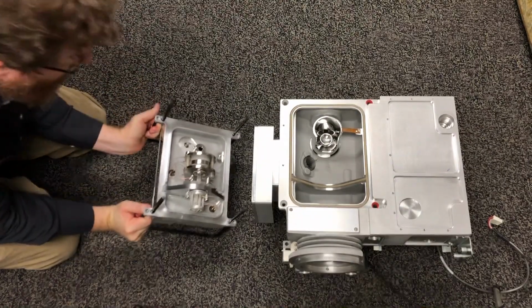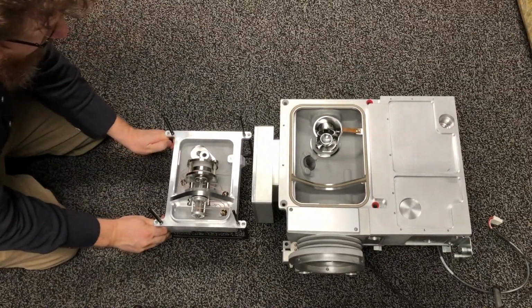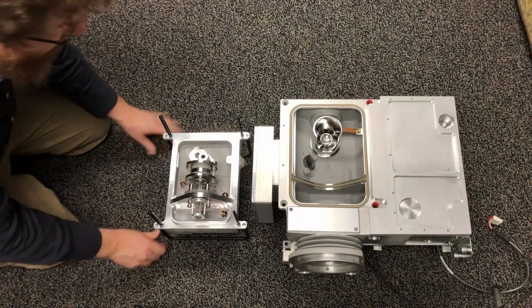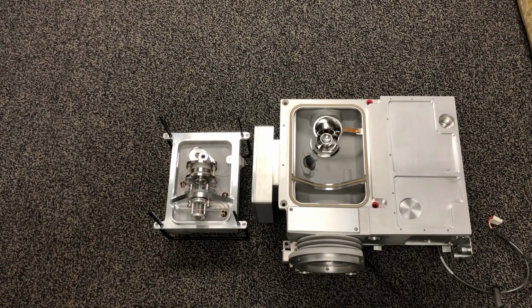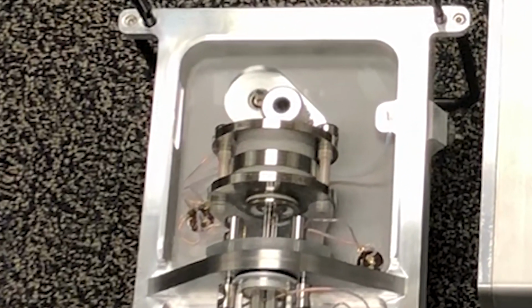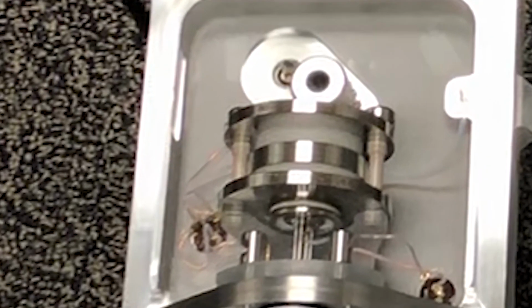So let's take it apart again. And let's look physically at how we're going to make this ion trap situation happen. So we paid attention to the ion optics before. We even looked at the detector. Now let's look at the actual ion trap. That is the actual ion trap. It's called a quadrupole ion trap.